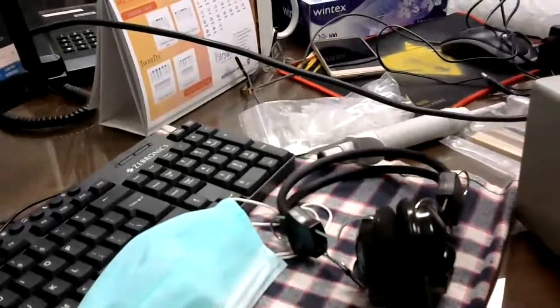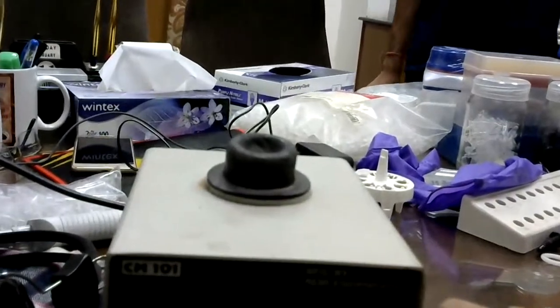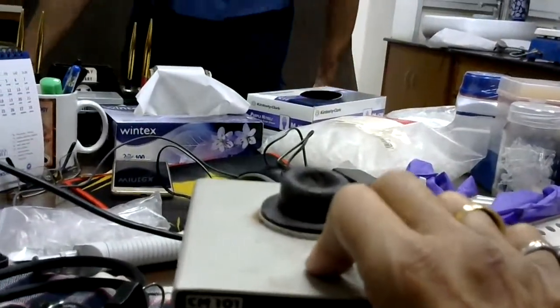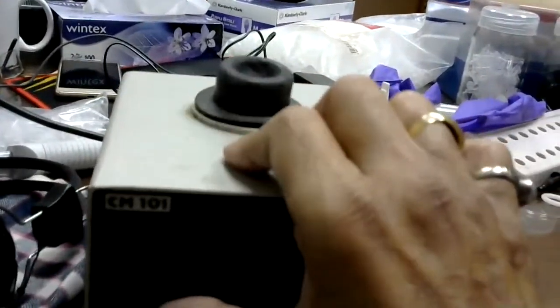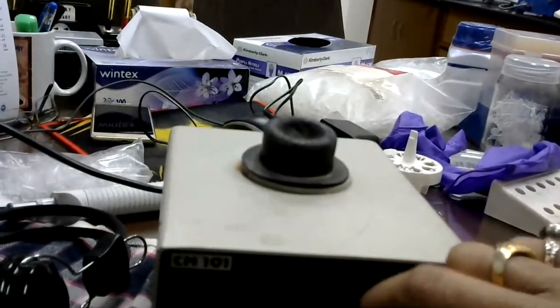Okay. Then we use a vortex mixer. So this is the vortex mixer. Okay. And you see this one. You see, this starts vortexing.